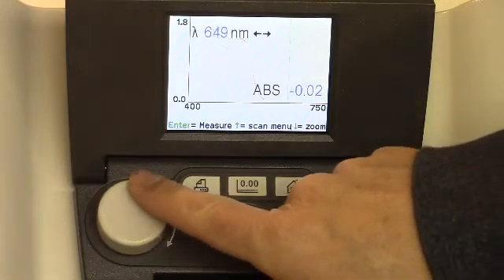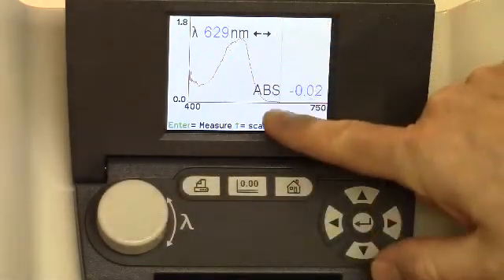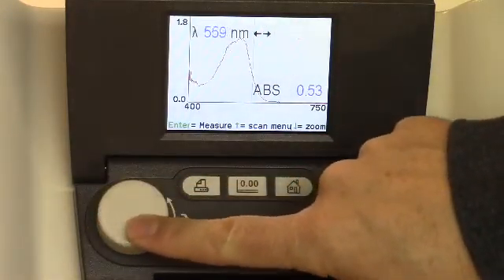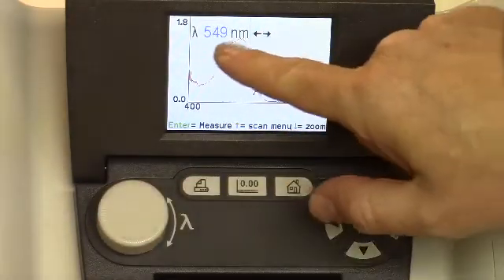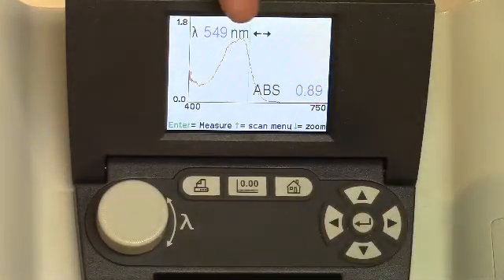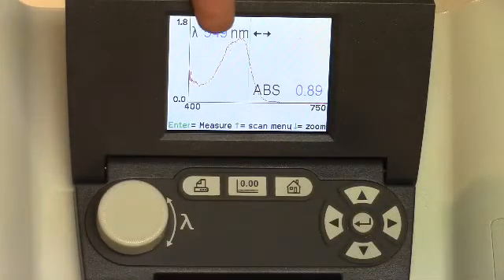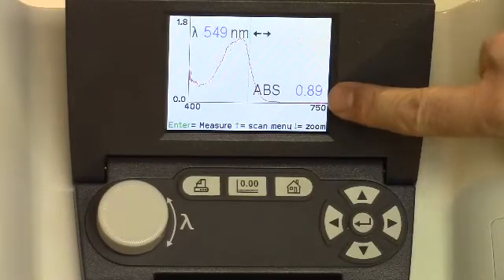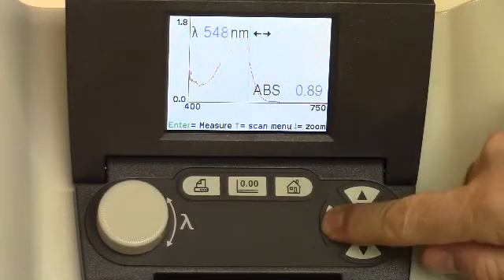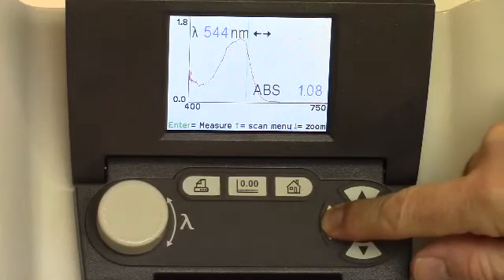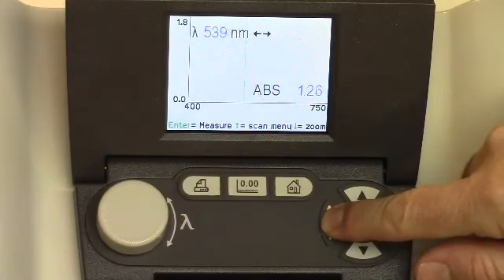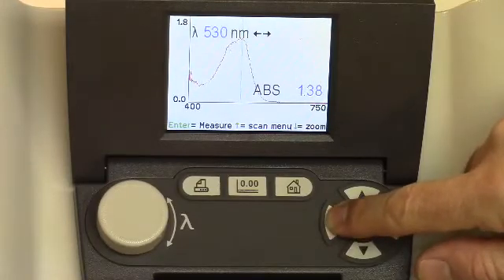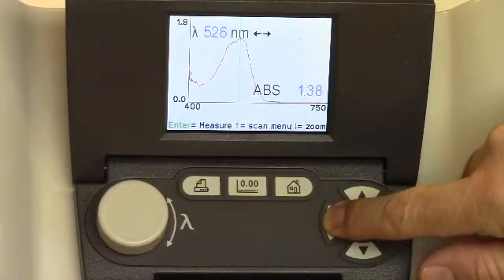So what I'm going to do is move this cursor. If you can see the kind of black and yellow line there, we're going to move this over here, and then I'm going to scan across this section. So you want to pay attention. What we're looking for is the wavelength, which is this number here, where the absorbance is the largest. And so as I scan across here, we'll just go one or two at a time. What we're looking for is the wavelength that has that largest absorbance.